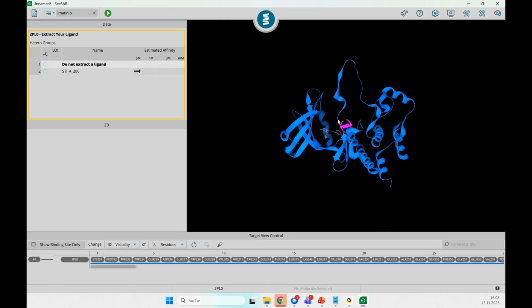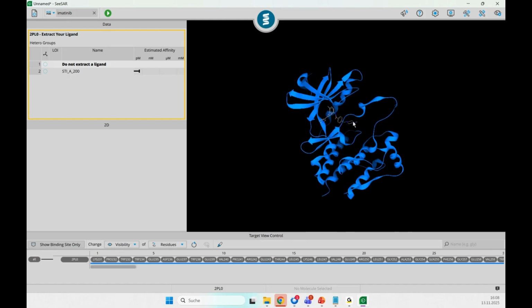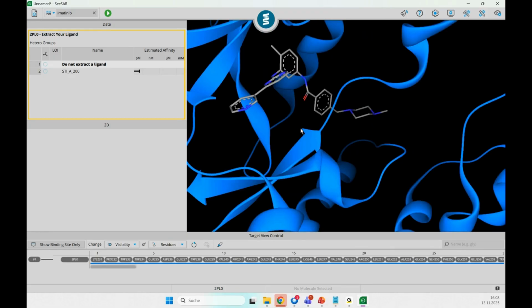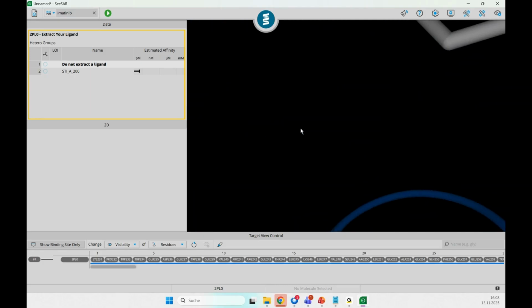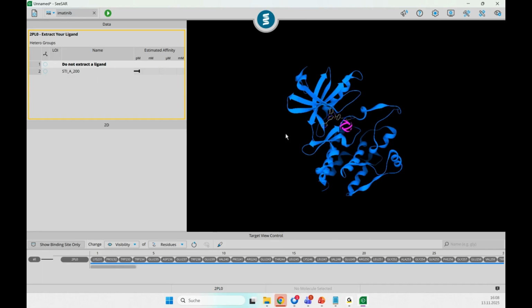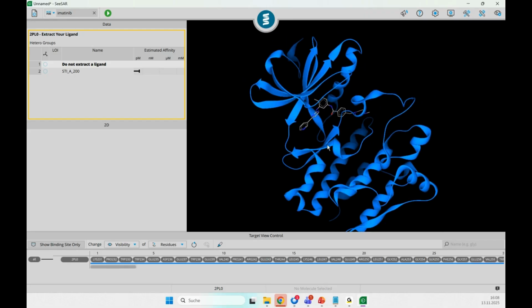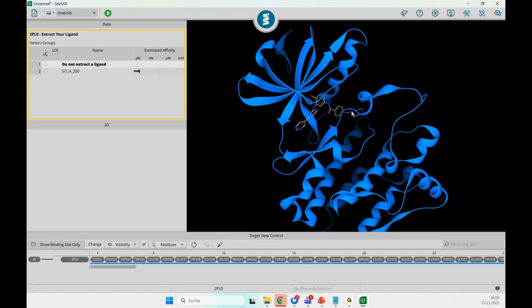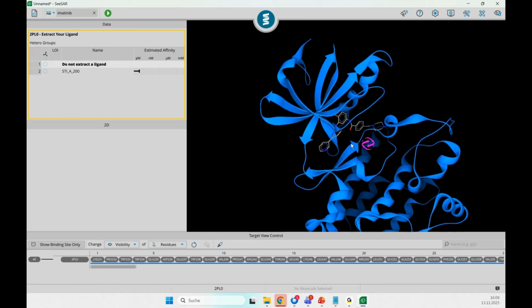The most important clicks and tools and keyboard tasks for you: with your right mouse click, you can turn the structure. You can zoom out and zoom in with the mouse wheel. And if you zoomed out too much or lost your compound, you can always focus with the space bar. The first thing I would like to highlight here is we are seeing we have our kinase with imatinib as the co-complex ligand, and obviously the hinge binding site, so no huge surprises here.